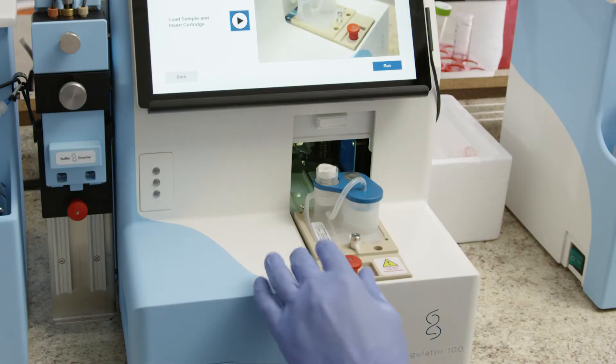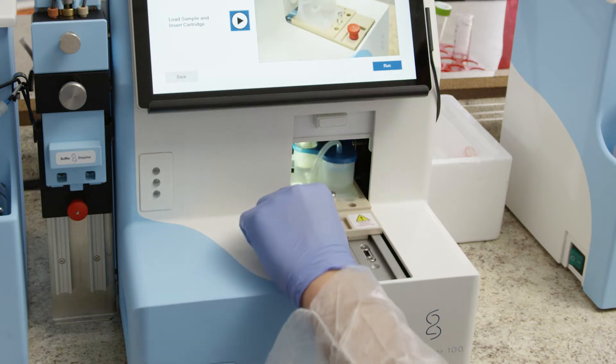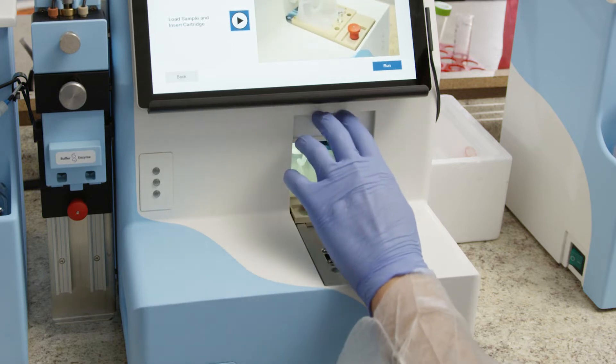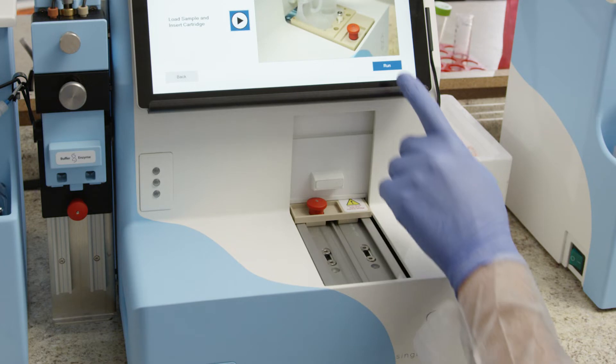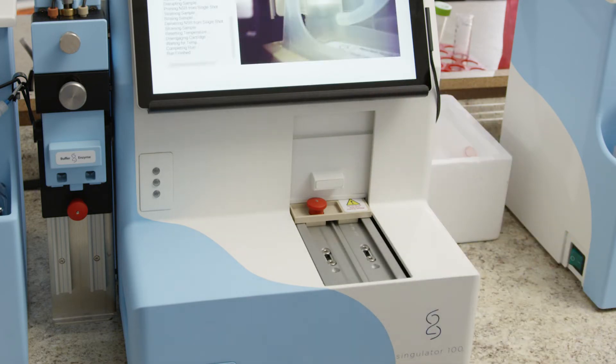Insert the cartridge into the instrument by pushing the stage from behind. It's important not to hold onto the red knob during this step. You should hear the red knob click into place when the cartridge is fully inserted. Close the door.